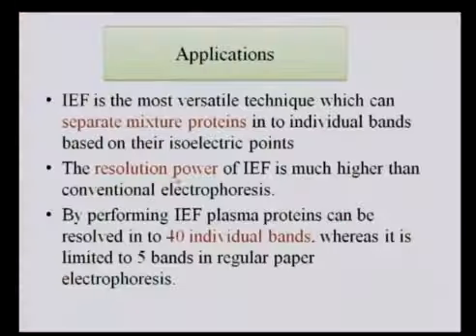And similarly, the other important application of this IEF is its high resolution power. In the very beginning we spoke about the resolution power. This IEF technique can separate your plasma proteins into 40 individual bands. Whereas if you compare this with paper electrophoresis, in paper electrophoresis we found that the serum proteins give 5 bands.